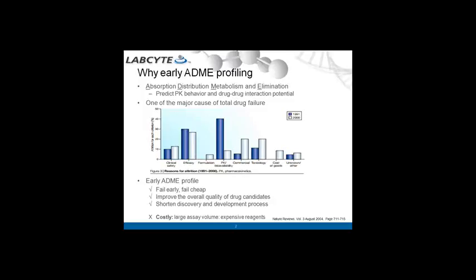In the late 90s, 40% of total drug failure was caused by poor ADME properties. Since then, ADME evaluation has been moved upwards into early drug discovery research. Multiple assays with a large number of compounds are being screened in parallel with cell-based assays. Only compounds with potent efficacy as well as favorable ADME properties are advanced into clinical development.